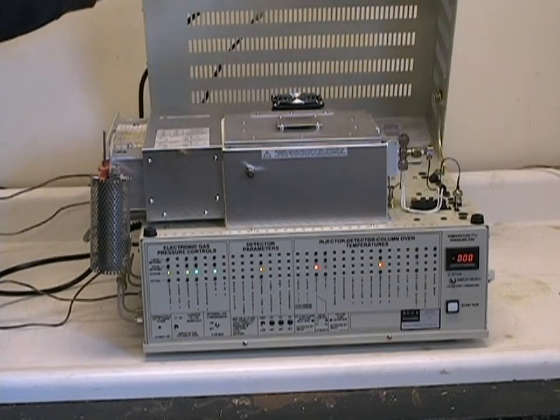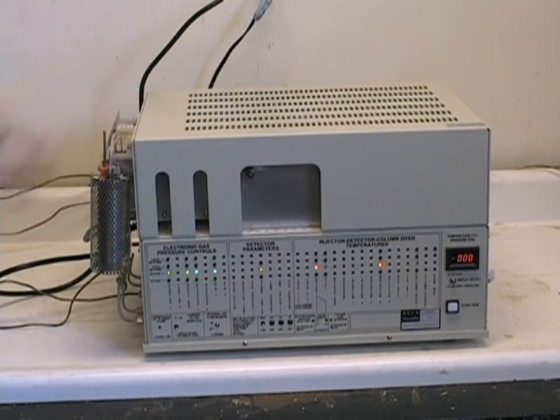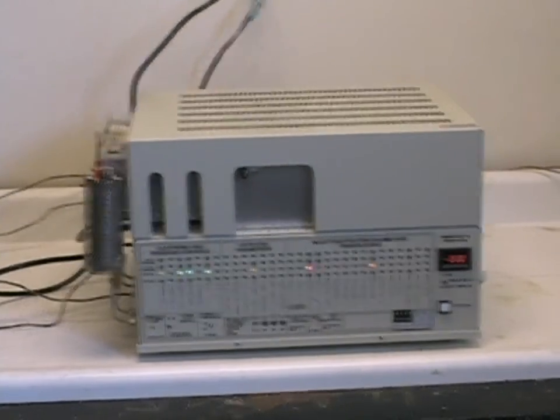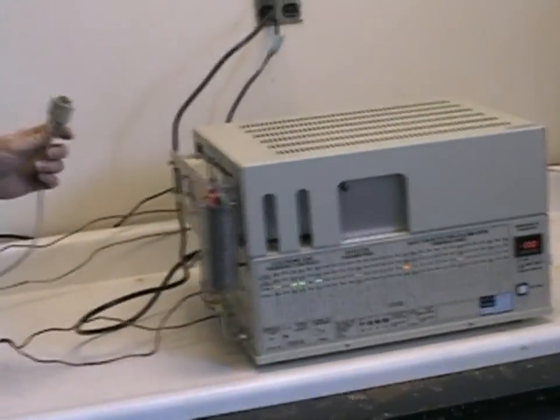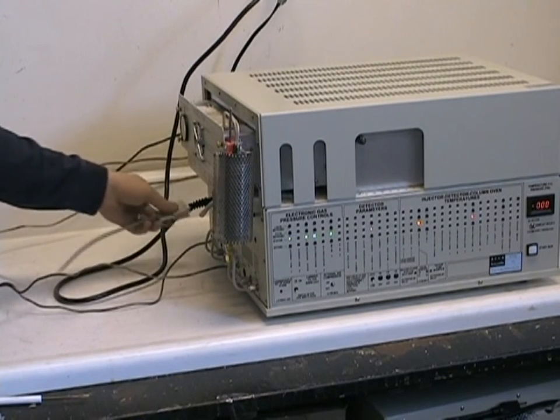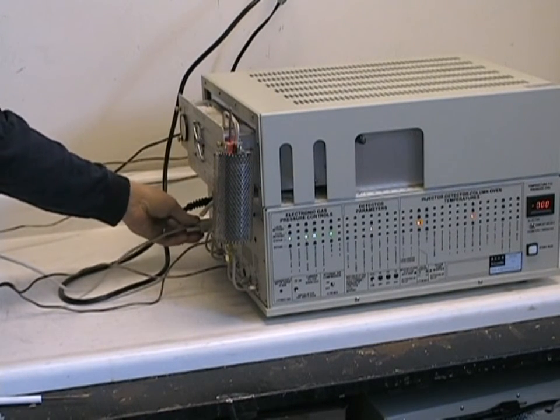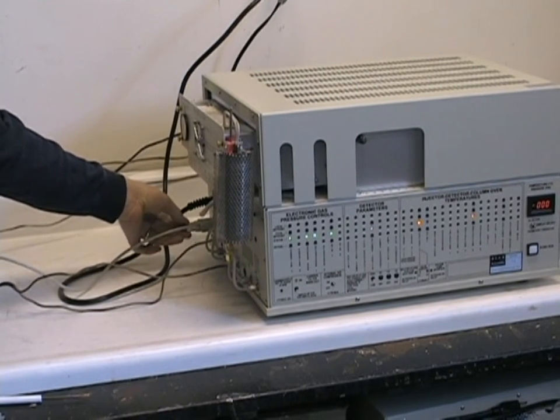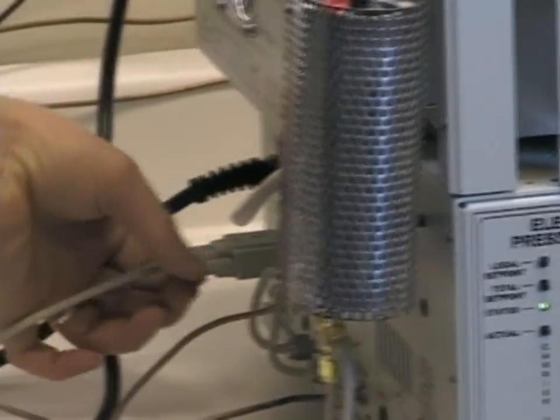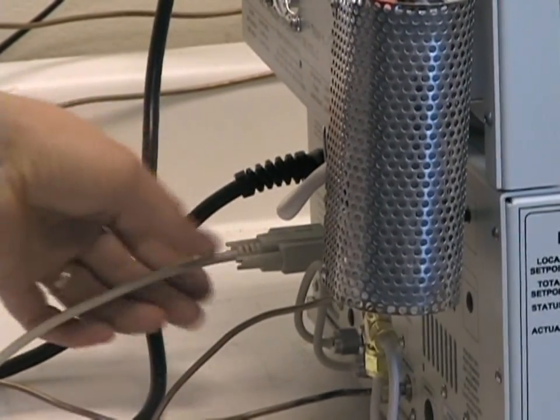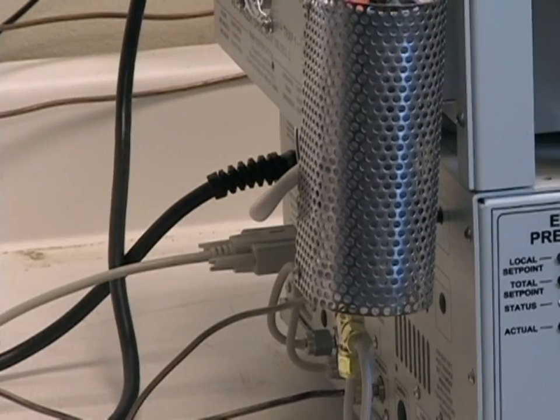We can now close the lid, and we are ready to plug in our PC using the 9-pin serial port and the interface cable provided on the left side of the GC. Be sure to tighten the fittings to make sure that you have a good tight electrical connection, since this is important for data quality transmission.